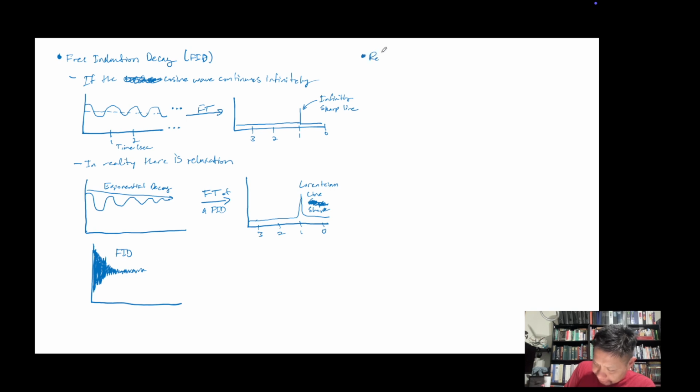because I mentioned it just now. Relaxation. There are two types of relaxation with respect to precessing protons, or nuclei in general, which is actually kind of ironic because the two types of relaxation are named after the two types of waves, which are the longitudinal waves and transverse waves. So this is called longitudinal relaxation and transverse relaxation.